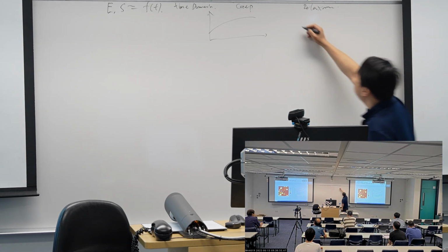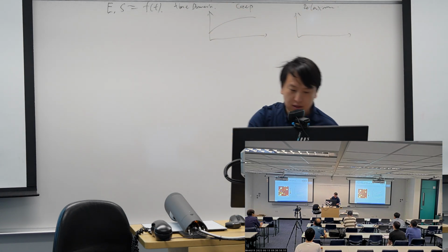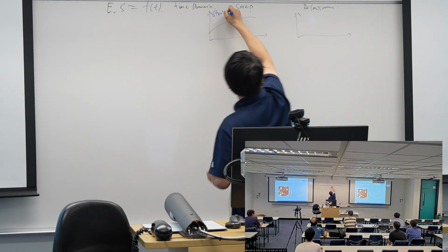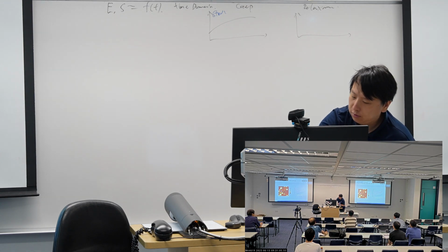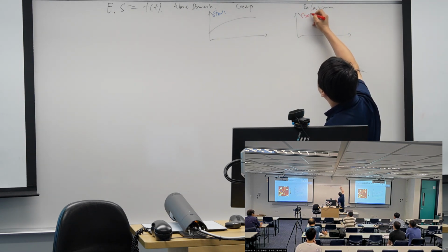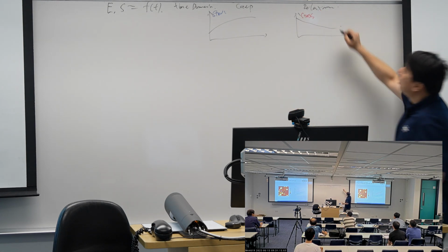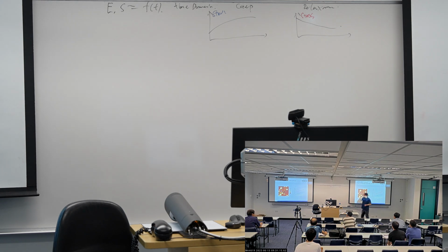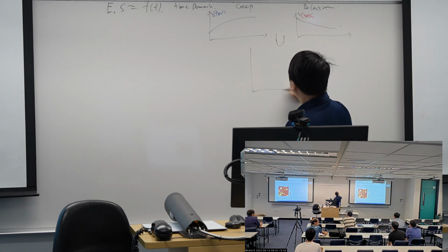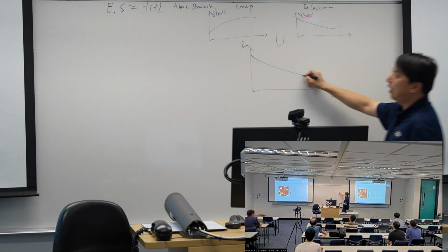And the creep and the relaxation is, if we fix a stress, we see how the strain changes, or we fix the strain, I give it a strain, and we see how the stress is changing. And from this we can detect how the modulus is changed against the time.